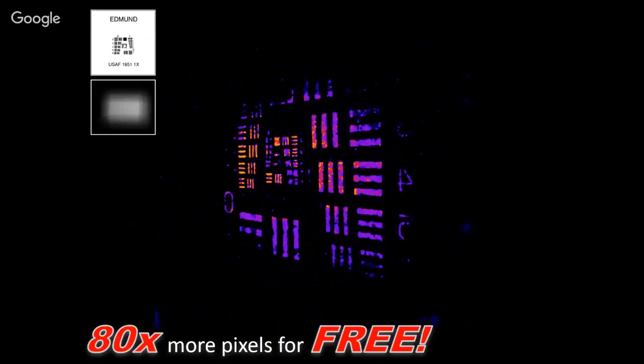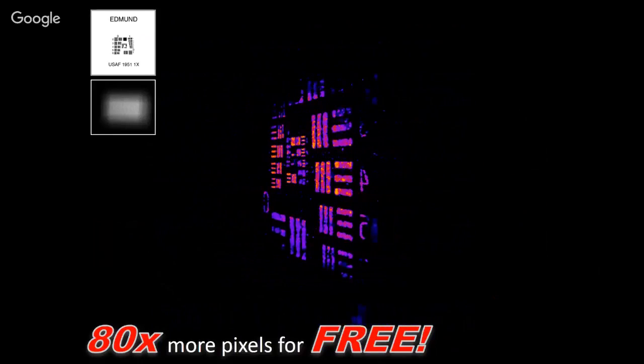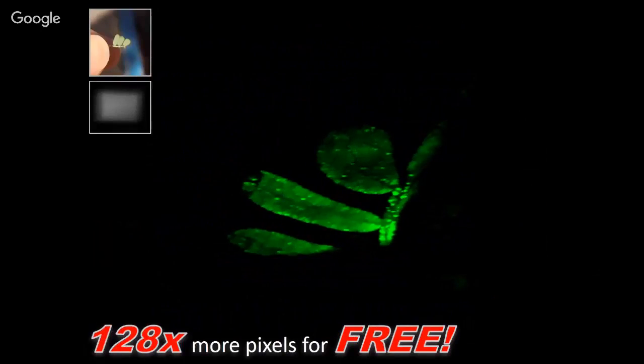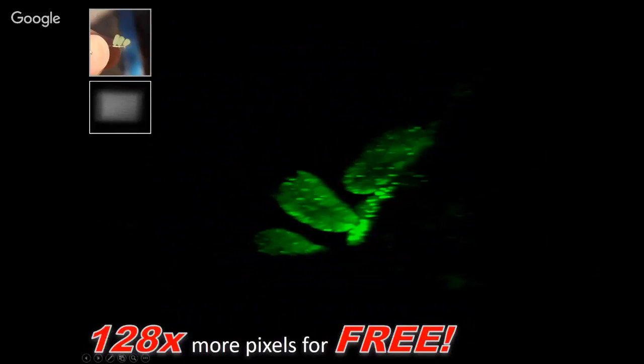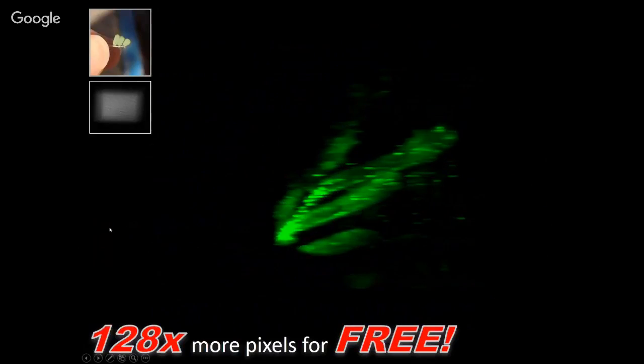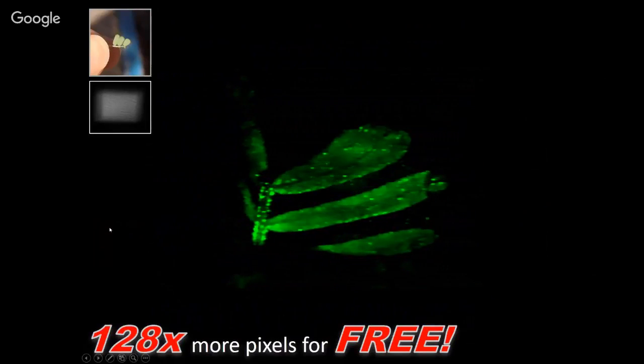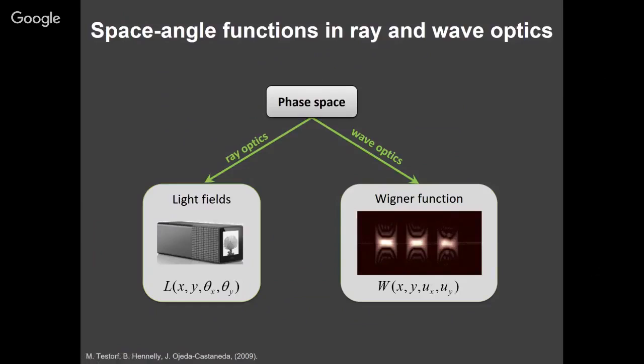But we're reconstructing more voxels than we measured pixels in the first place because we can do this sort of sparsity enforcement. Here's another object. This is just a little leaf, so you can see a picture of it here. And there's a single raw image that reconstructs this 3D stuff. Okay, so I wanted to talk about that because I'm going to get to it a little bit later. We're going to use it for neural activity tracking, but we haven't totally gotten there yet. So I want to go to something a little bit different but related.